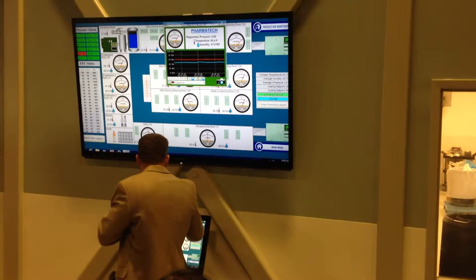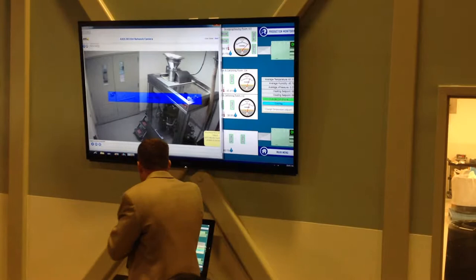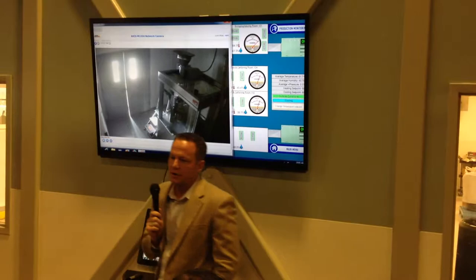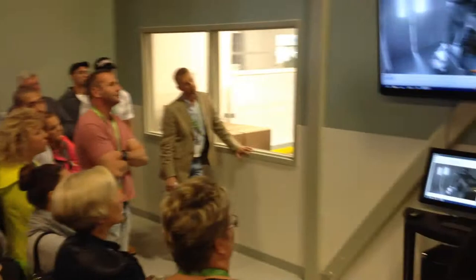The other piece of equipment we have is this Bosch encapsulator. This machine is pretty small, but it'll do 90,000 capsules an hour — very impressive. We just recently ordered, or are in the process of ordering, another Bosch, the next size up. It takes the same floor plan but has double the dosing capability and will do 180,000 caps an hour.